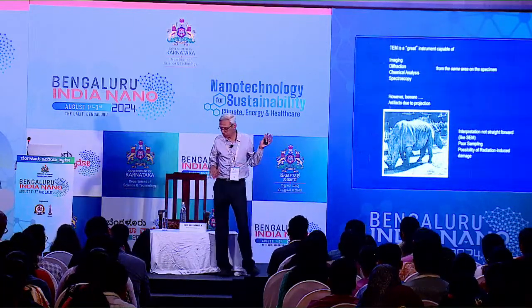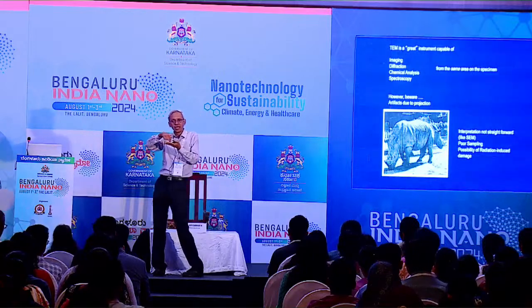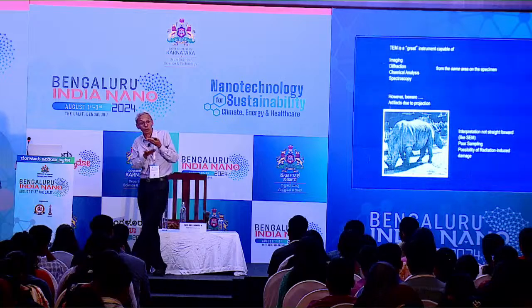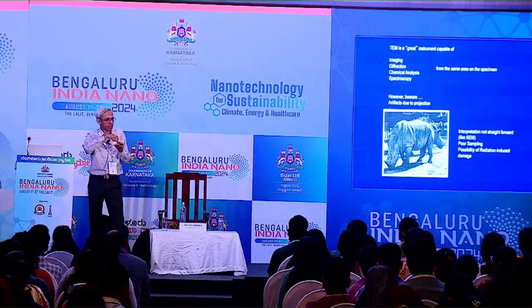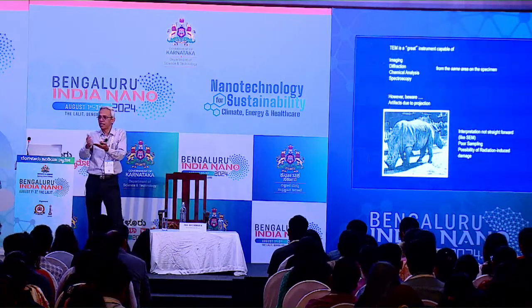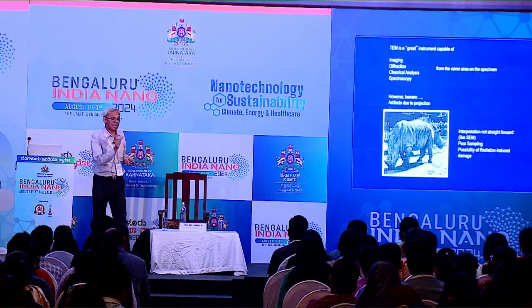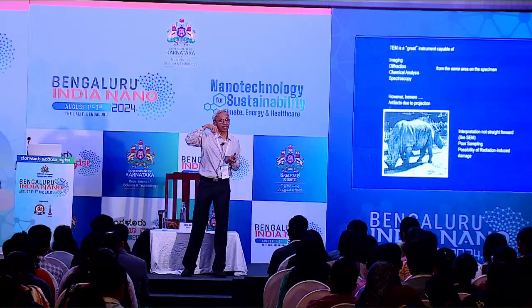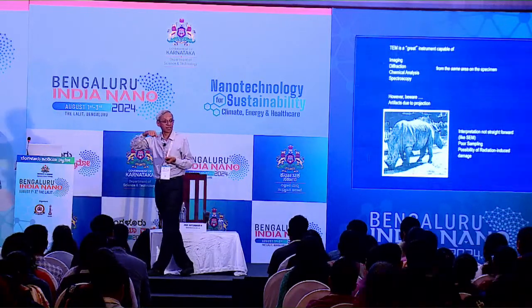And there's another thing, spectroscopy. The electrons, when they go in, can transfer energy to the material, and therefore what comes out has lower energy as compared to what is going in. Suppose something is going in at 200 kV, it comes out at slightly lower energy. So these energy losses are characteristic of the various inelastic processes that can happen in a material.